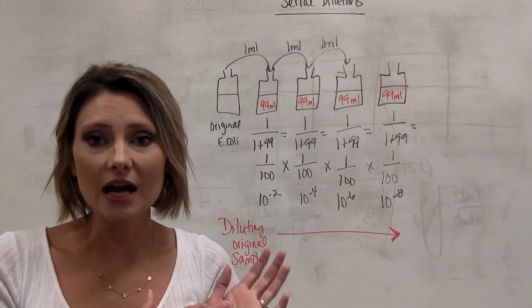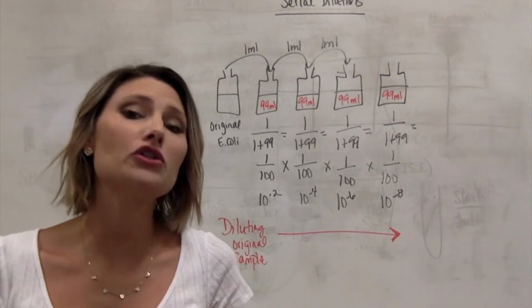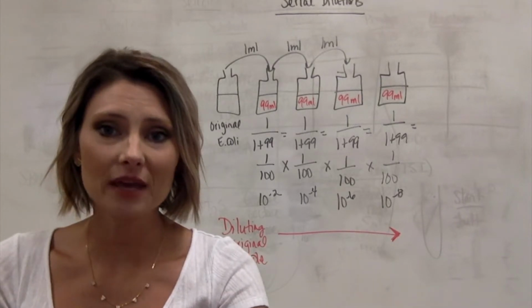There is a diagram in your lab manual very similar to what I have up on the board. So I'm going to go over that, and then I'm actually going to do the dilution for you, showing you exactly how you would be doing it if you were in the lab with me.